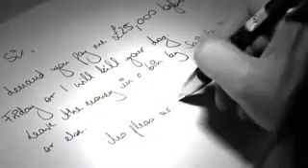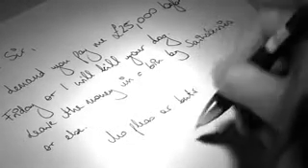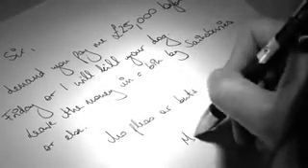As my research continues, I will explore other techniques for the analysis of gel inks. When I have completed my work, I should be able to recommend a new series of tests that can be used to compare different brands of gel ink that can be used by forensic scientists around the world.